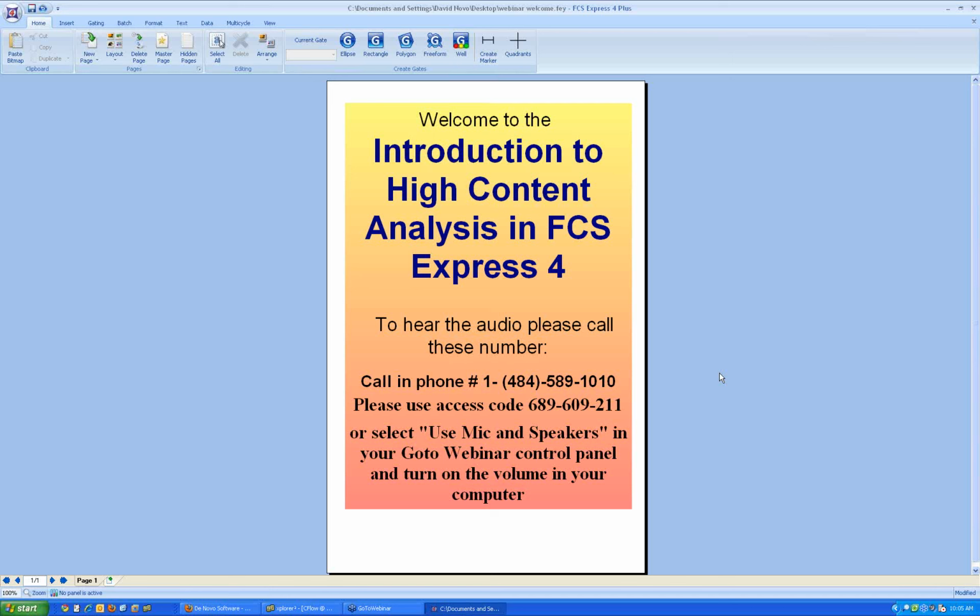So the first question is, what formats do we support for high content from the flow cytometry side? We support almost every flow cytometer that we found that has a high content device that you can use a 96 well plate or any other size plate reader with it. The BD HTS system, the Accuri C6 cytometer, the Guava instruments, the Eclipse from Sony, the Quanta from Coulter, I think I'm missing a few probably. From IntelliCyt, sorry, we support their device, or if you have any of their add-ons that add a 96 well plate reader to an existing flow cytometer, we can read those as well. So any device that basically has a high content or a plate reader attachment possible.